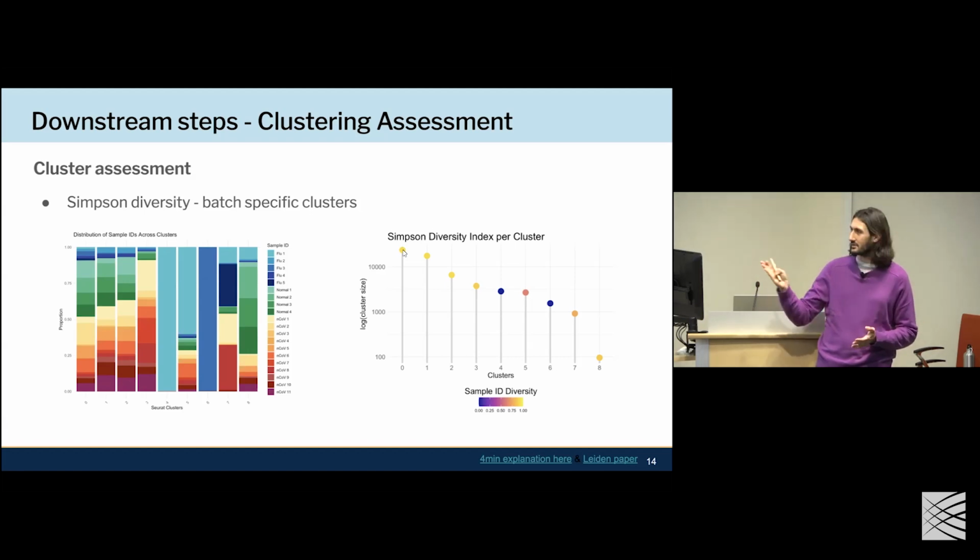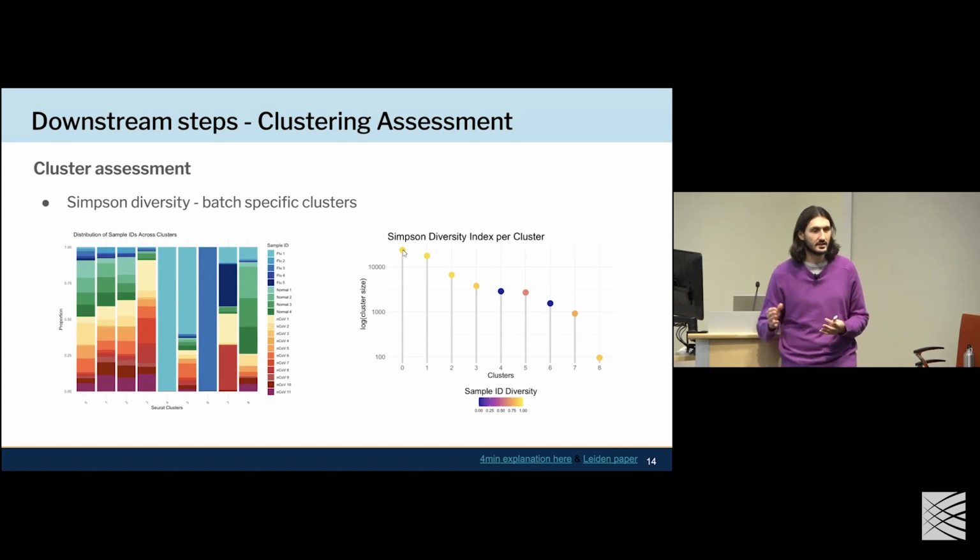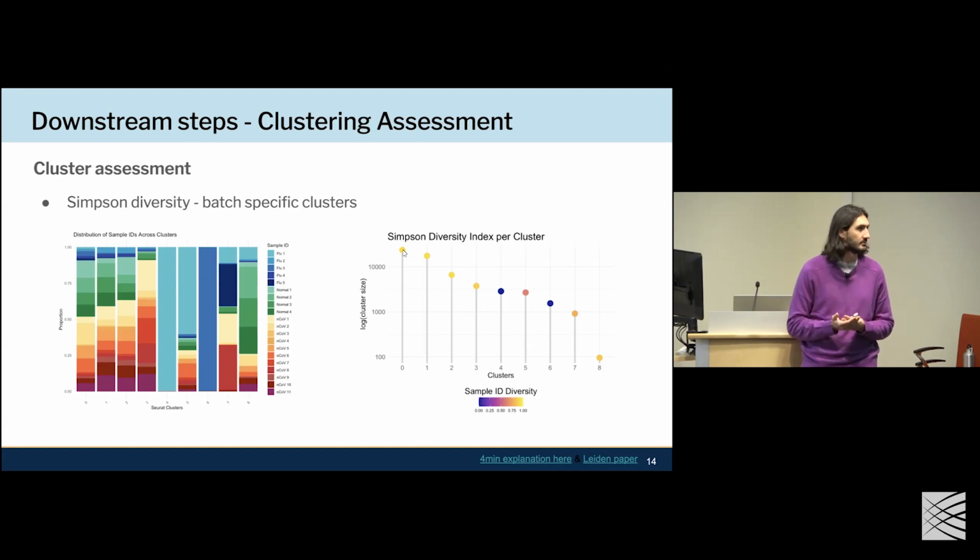In this case, I believe cluster 4 ended up being platelets. So it was a sample that just had a lot that wasn't cleaned up well in terms of the blood wasn't fully removed. So we had a lot of hemoglobin genes in cluster 6 and a lot of platelets in cluster 4. So we ended up removing these because they were not a cell type that we're directly interested in, and that had just missed, let's say, the sample processing quality steps. But again, just by looking at this, I would not remove the sample, that cluster.